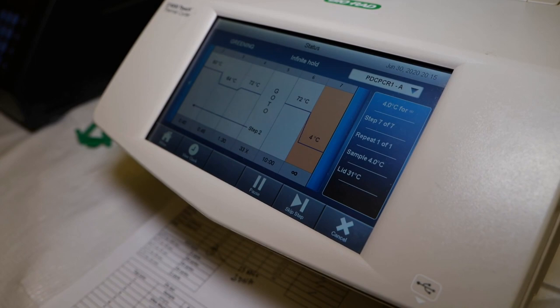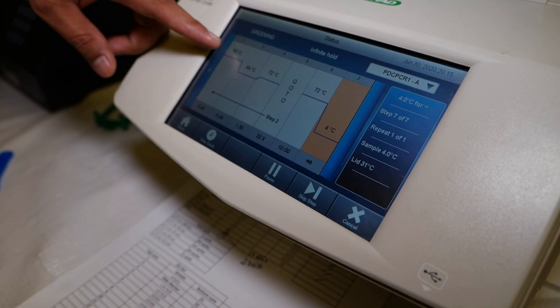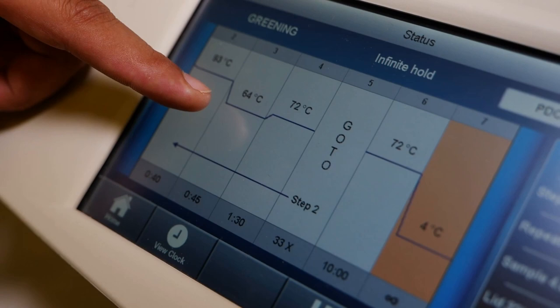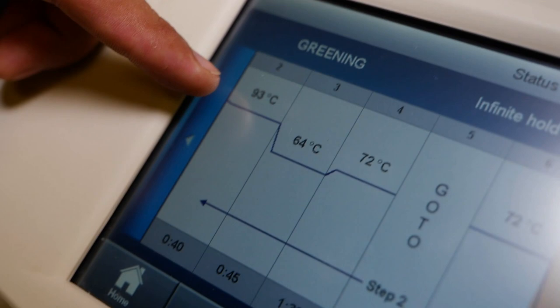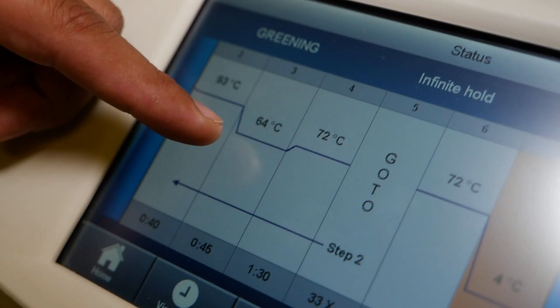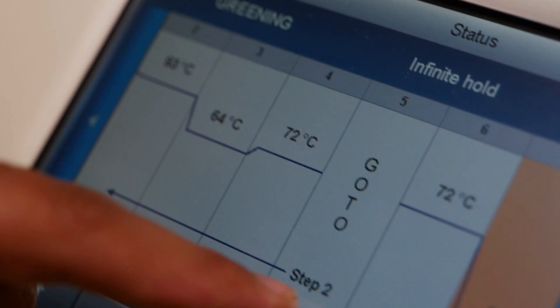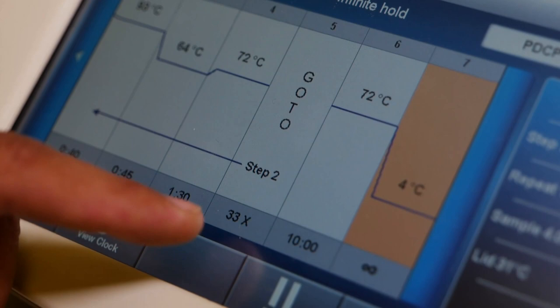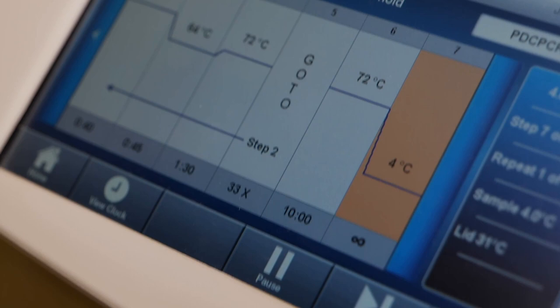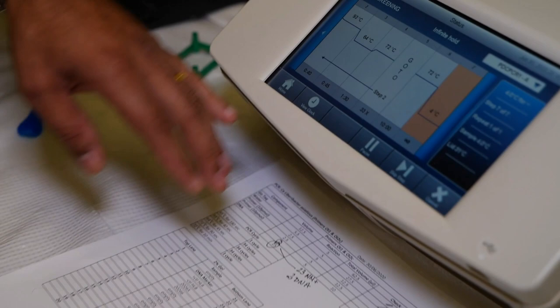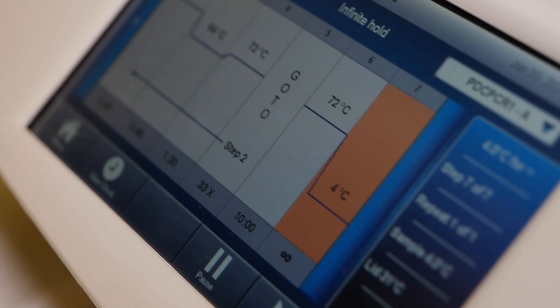We are still running a conventional PCR here. In this case there are three different steps that it will run for several - I would say 40 steps, and each cycle has three steps in it. You can see it goes to 93 degrees Celsius, and then it comes down to 64, and then 72. This is called denaturation at 93, and at 64 it's annealing those building blocks. It's making that, the DNA, amplifying the DNA. And then this is at the last step is 72. And then it will repeat. It will go back, repeat. You can say it's going to repeat here. On this particular test that we're running, we are running this for HLB, which is your citrus greening disease. This will run for 34 cycles. It will run for 34 cycles with these three steps, and then we will go back, use the gel documentation system to see if it amplified the DNA or not.